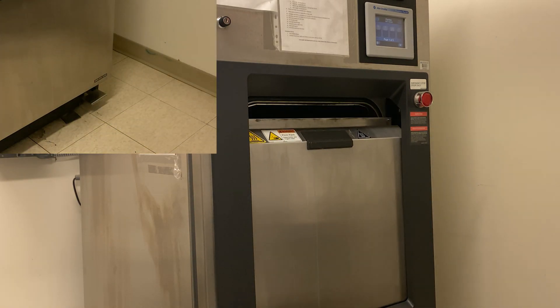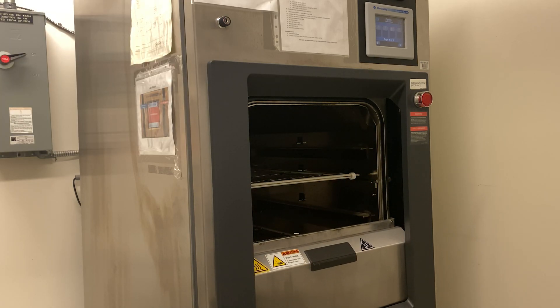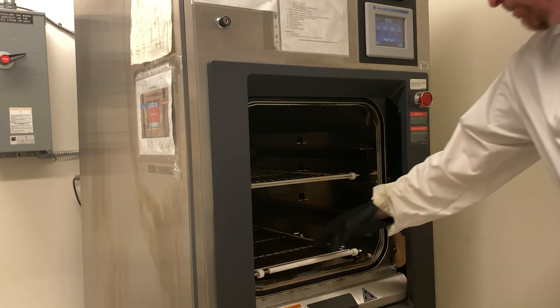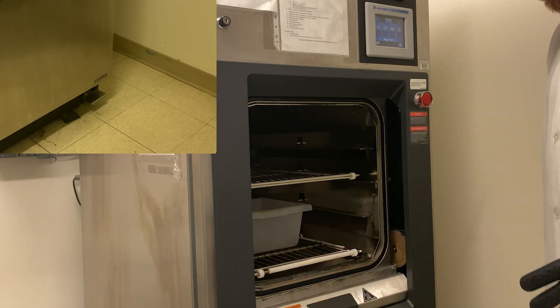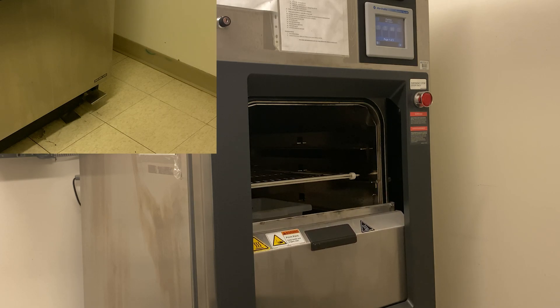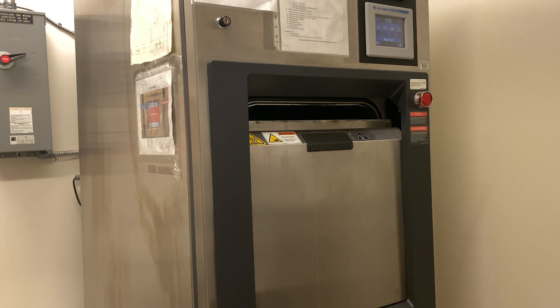A pedal on the ground opens the door to this autoclave. The heavy door slides down, revealing the inside compartment. Inside are two racks. Make sure you wear heat-resistant gloves to protect your hands, and don't reach in with your arms. The racks slide out. Your sample is placed into an autoclave bin, placed onto the rack, and can be slid in. Press the pedal again to close the door. Make sure you don't get your fingers stuck in the way — if you do, that's what the red button is for.